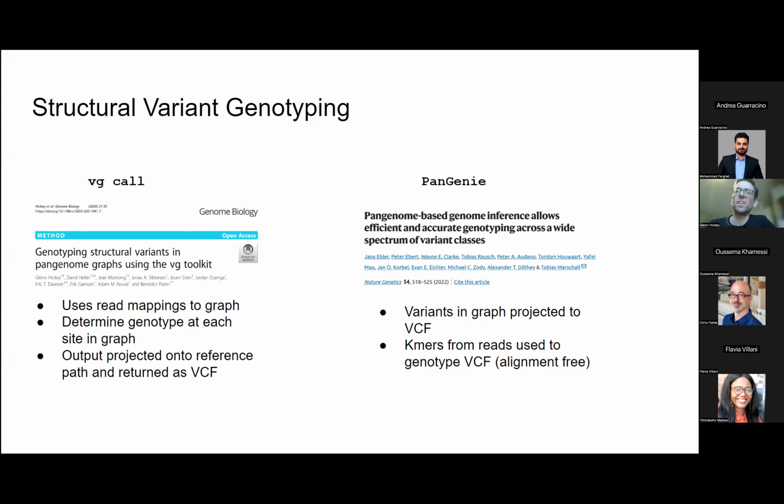Okay, just a summary of my talk. So pangenome graphs have two broad categories of uses: to study diversity within the samples, or as a reference for applications such as mapping and SV genotyping. So to leverage the diversity to understand other samples. Minigraph-Cactus is kind of a balancing act between those two things.